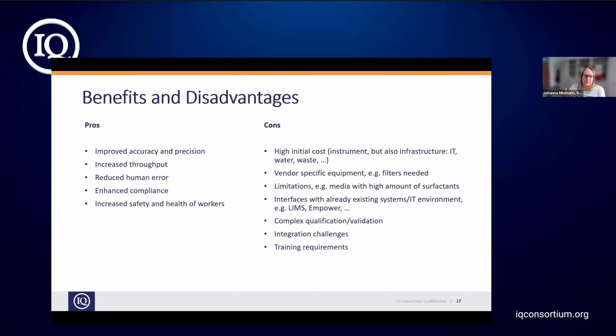But overall, everything else runs by itself or a lot more smoothly. You omit or reduce human error, especially if you have samples which are sensitive to any kind of disturbance in the vessel, and you have different people drawing samples and maybe pushing with more or less force the sample into the vessel, which can have an impact.